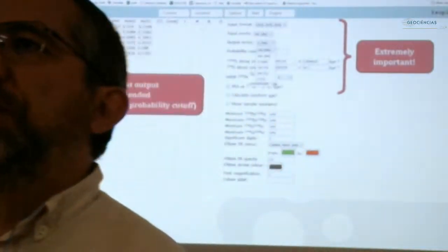For the output errors, again, I highly recommend you always work at the same uncertainty level, the 2 sigma level. So I would recommend you work with 2 standard errors. But again, it depends on you to decide. What is extremely important is that you be consistent. If you're going to be working with one standard error uncertainties, you have to always be working with one sigma. You don't change it in your data analysis.